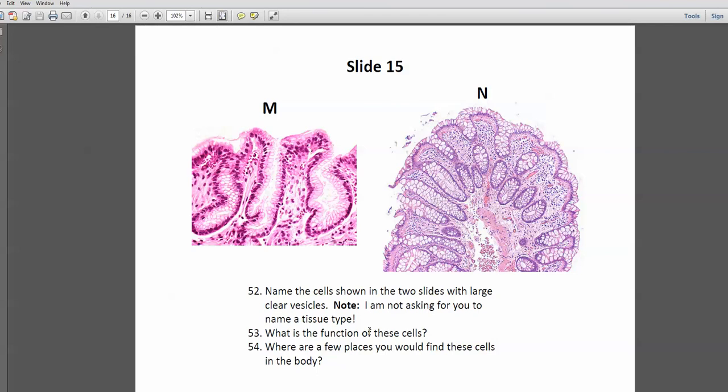Okay, and I do believe this is the last slide. And here you were just asked to identify the cells, and these of course are goblet cells. Goblet cells look like they are empty, but what you're looking at here are the large vesicles the goblet cells contain, which contain mucus. Goblet cells secrete mucus. So that's what you're looking at here.